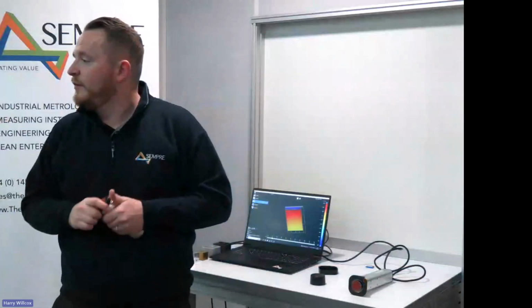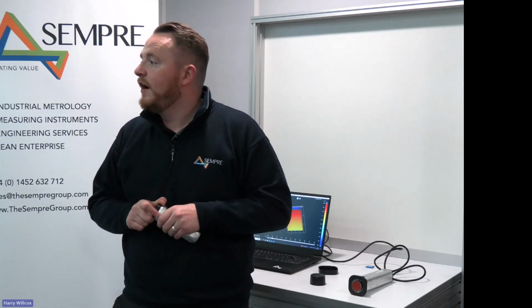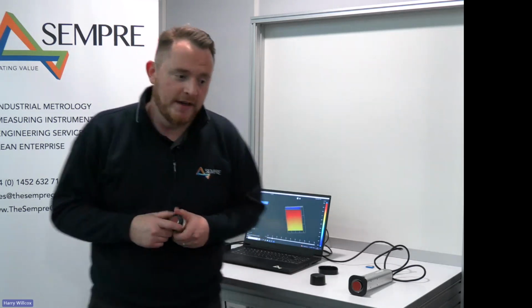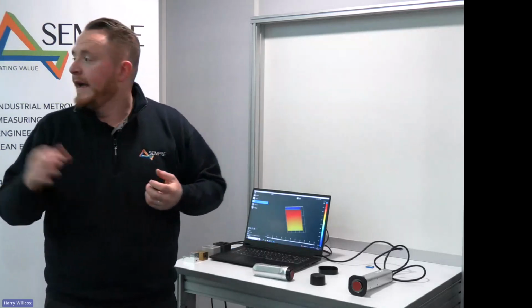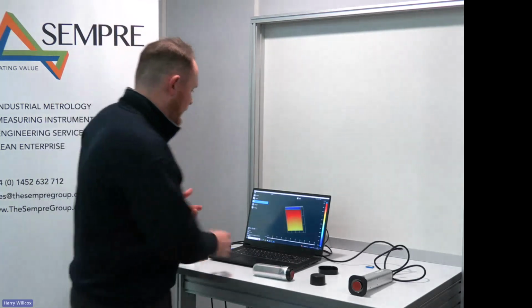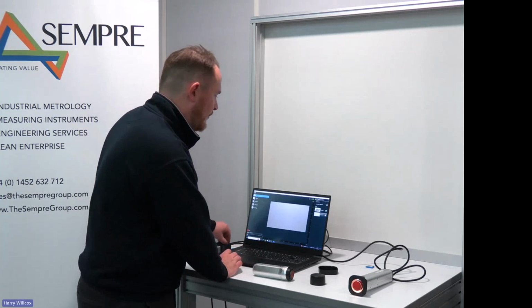So I'll go down to the next question, which is, can it read highly reflective surfaces? Are there any limits to the access of concave radii? Hopefully we went through some of the principles on access issues, and if you've got any further questions or queries on that, then please let us know. If we refer to the top section, when we look at the sensor itself, I've got some samples here that will be good to demonstrate that.